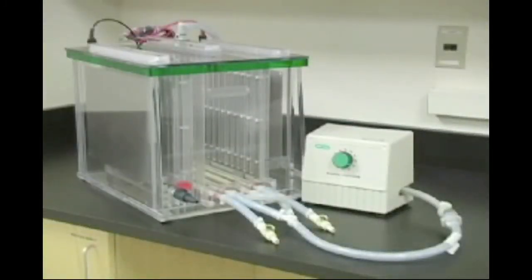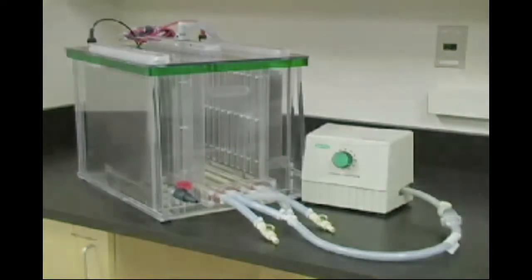Ensure that the cassette is placed in between the gaskets. The cell is now ready to be filled with buffer. Make sure the buffer level is just below the height of the glass plates.